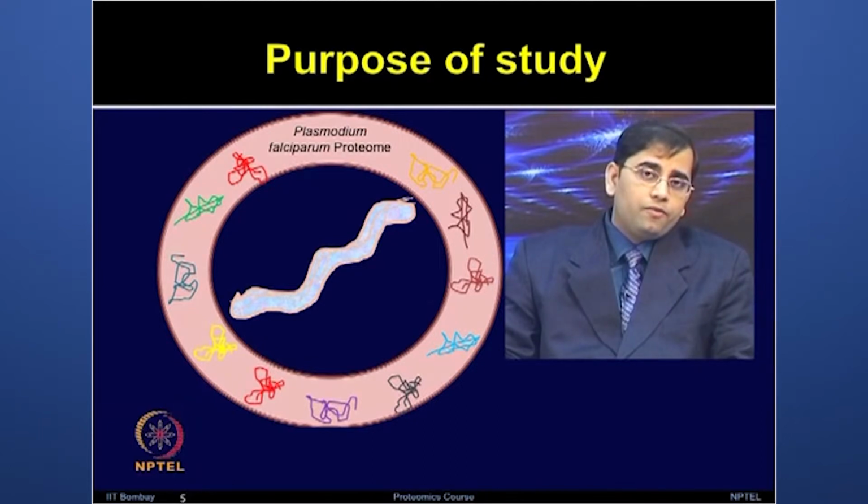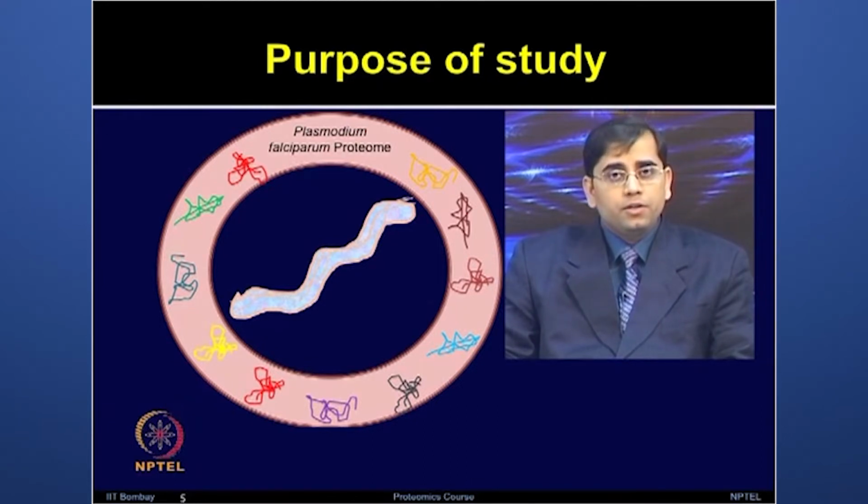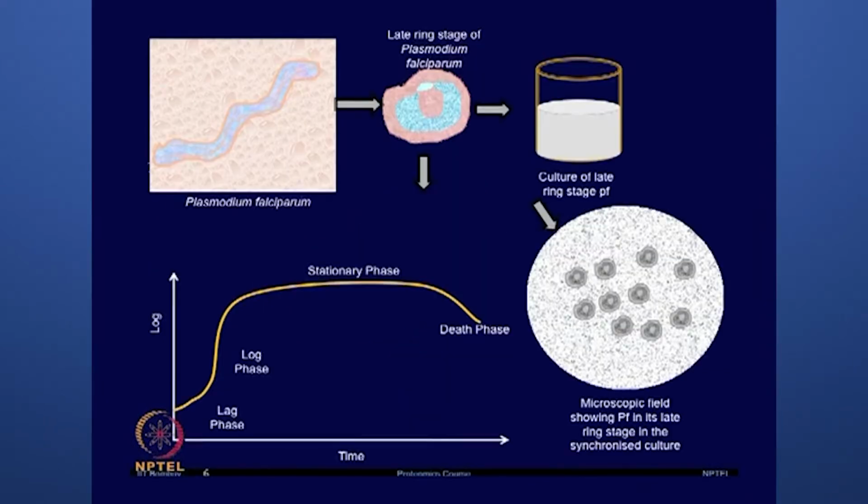So, certain proteins were found to be commonly upregulated due to both of these drugs, and certain proteins have different patterns. But before looking at the proteomic alterations, authors first determined IC10, 20, 50 and IC90 values for both the drugs ARM and LUM. We will use the abbreviations now for artemisinin and lumefantrine. An effect of these concentrations of drugs on parasite growth over 24 hours was characterized.